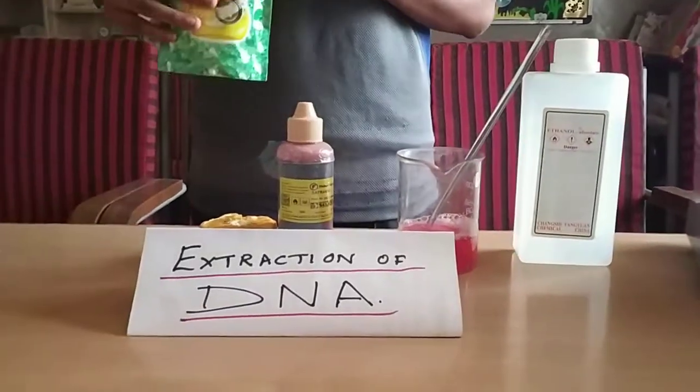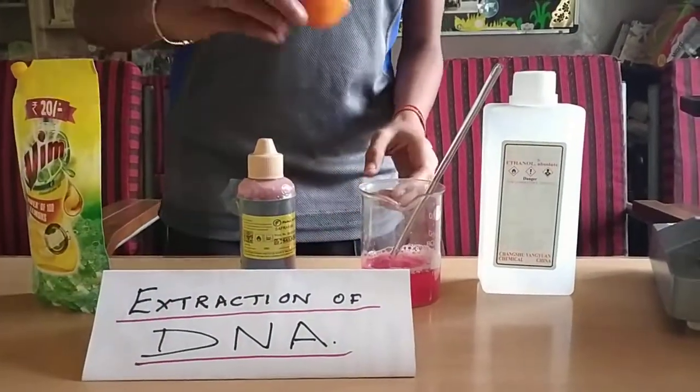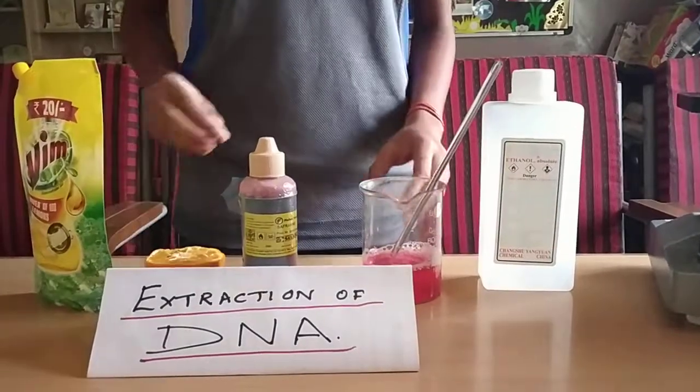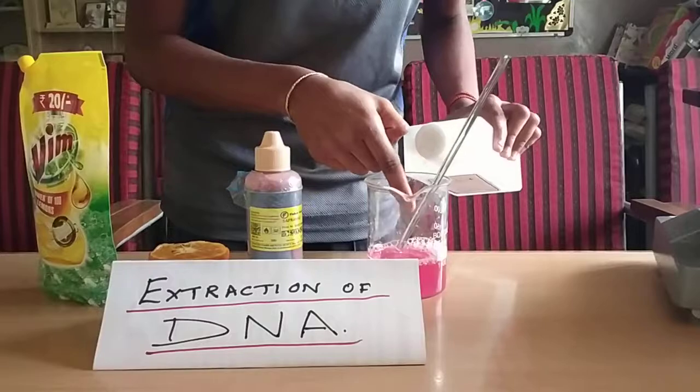Then add some liquid soap to it and stir it gently. Then also add fruit juice to it and stir it slowly. Then take 100 ml of alcohol and pour it along the sides of the beaker.